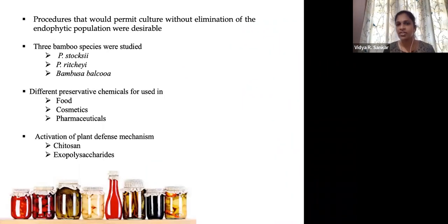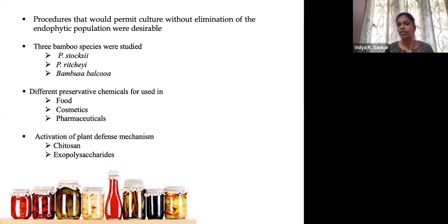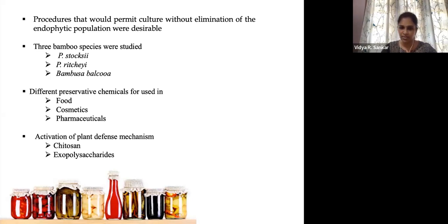From this study, we understood that complete elimination of endophyte bacteria is not desirable. So we selected these bamboo species, stocksii, ritchiei, and Bambusa balcooa, and elucidated certain protocols for controlling latent contamination using eco-friendly methods. For that, we selected chemicals that come under the category of GRAS, that is Generally Recognized As Safe. Most of these chemicals are commonly used in our day-to-day life as preservatives in food, cosmetics, and pharmaceuticals. We also activated the plant defense mechanisms, since plants have a mechanism for resisting invasion by micro-organisms.